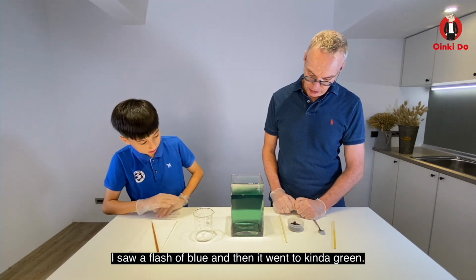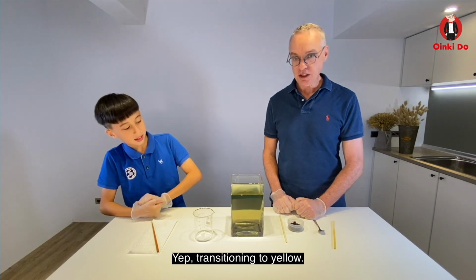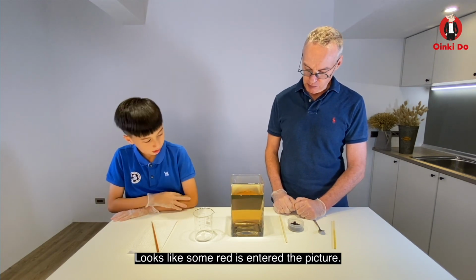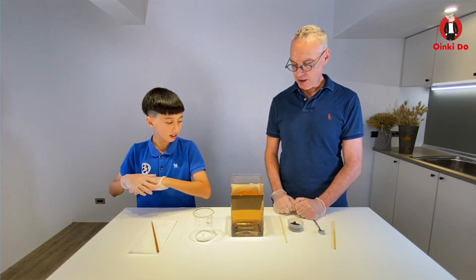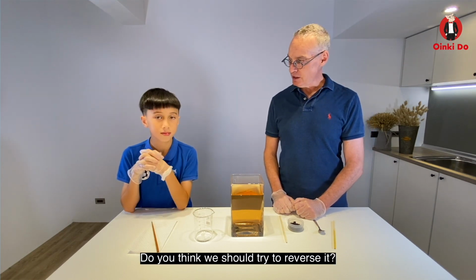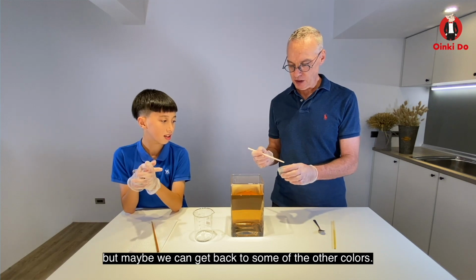Flash of blue, and then it went to kind of green. Yellow. Yep, transitioning to yellow, and looks like it's still going. Looks like some red has entered the picture. Amber. Yeah, that kind of looks like a nice amber color. It looks kind of stable at that point. You think we should try to reverse it? Yeah. Let's see what happens. I doubt we can get back to purple, but maybe we can get back to some of the other colors.